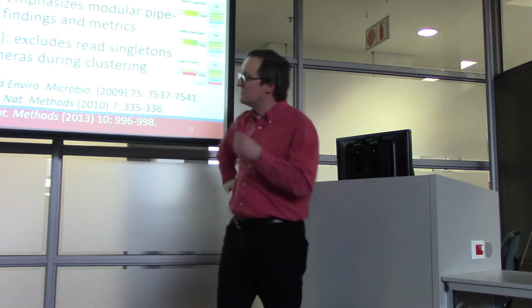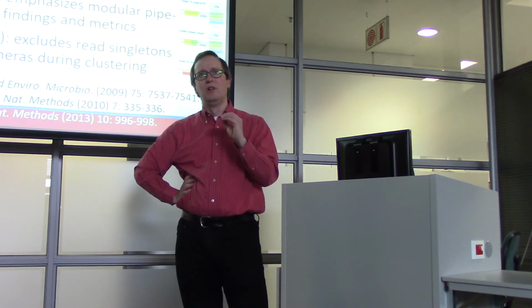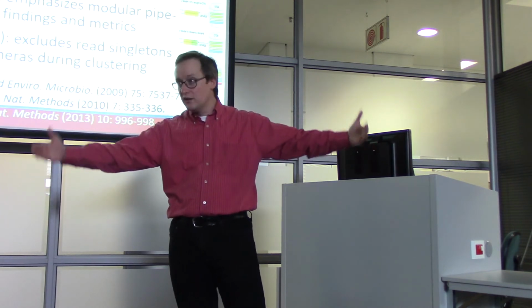So histogramming distinct sequences. One of the things that we operate from here is being able to count how many different sequences do I have for 16S rRNA.